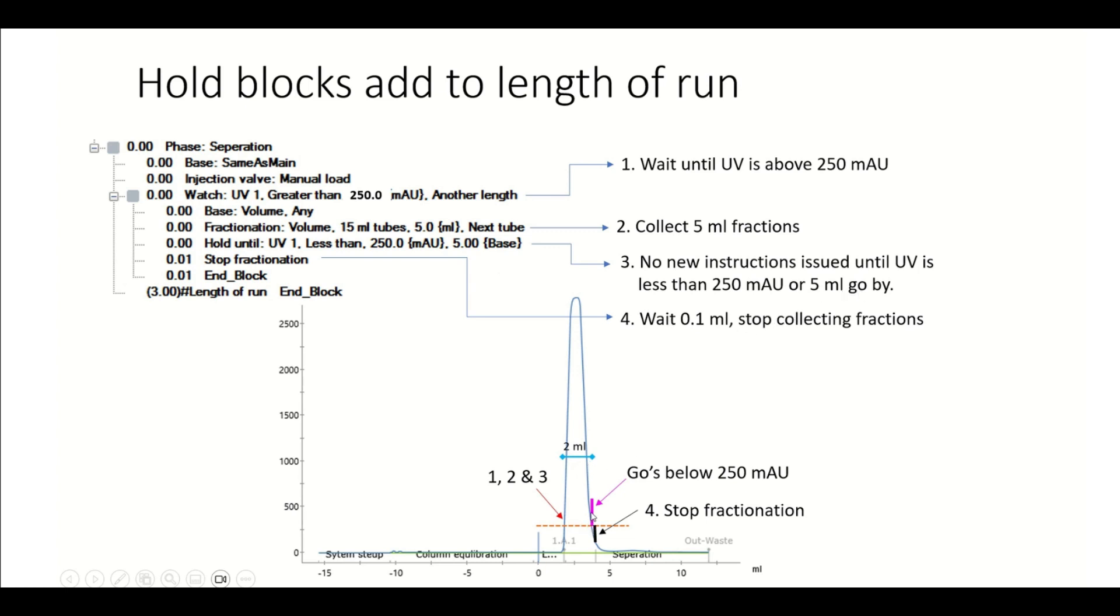So right here is when the UV goes below 250 at this pink line and this black line, that's when we stop fractionation. So just a fraction of a mil later. And that's number four, wait until 0.01 mils and then stop collecting fractions. And the reason I did this is so we don't have to jam a delay block in there, because if we have this hold instruction and the stop fractionation instruction more or less read at the same time, because remember timing is everything, we could potentially start the hold and stop fractionation at the same time, which would kind of suck. But if things go off according to plan, we're going to start collecting UV as it goes past 250 milli-absorbance units. And then we're going to wait two mils, emphasis on the word wait, and then it's going to come back down and then we're going to stop collecting it. So what happens with these two mils right here? Well, that time, that volume and time, is not going to be recorded in the duration in variables here.